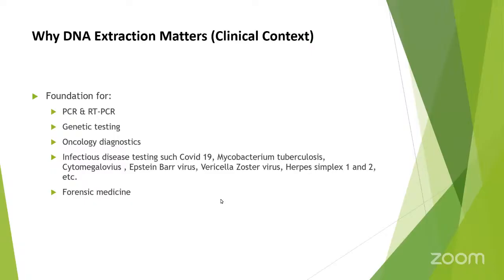So, why does DNA extraction matter? We ask ourselves. The foundation for this is polymerase chain reaction and real-time polymerase chain reaction. We have also genetic testing, oncology diagnostics, and infectious diseases such as COVID-19, MTB, Mycobacterium, CMV, Epstein-Barr virus, varicella zoster, herpes simplex 1 and 2 virus, and this also applies in forensic medicine.